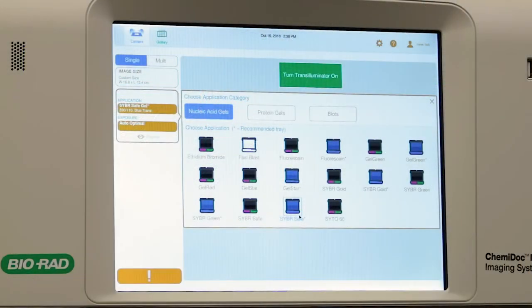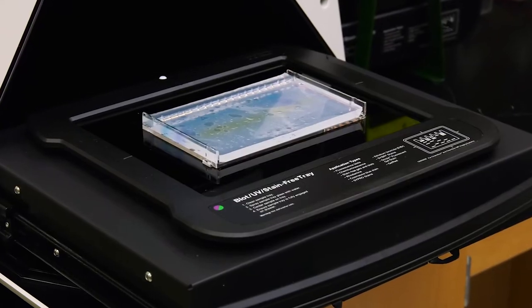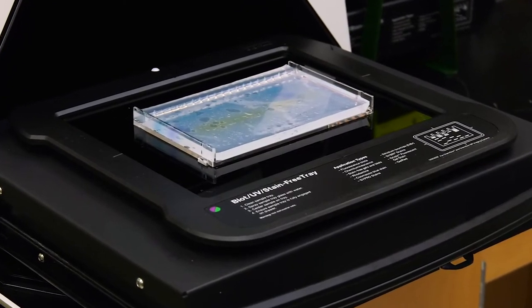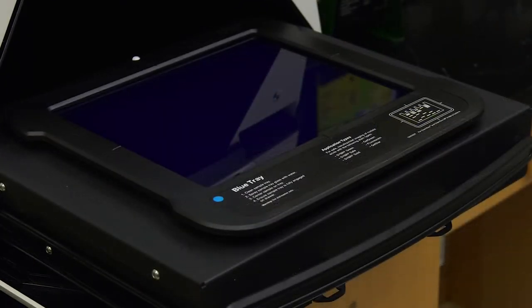SmartTray technology automatically recognizes the application-specific trays and will adjust imaging parameters and software options. For imaging CyberSafe DNA applications, use the UV tray or the optional blue tray.